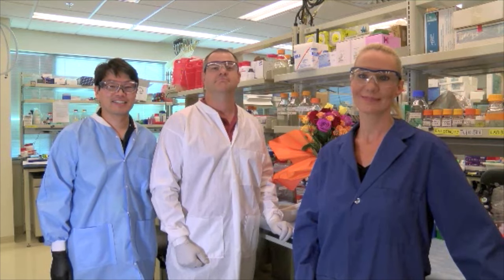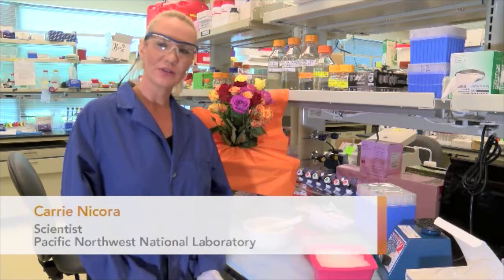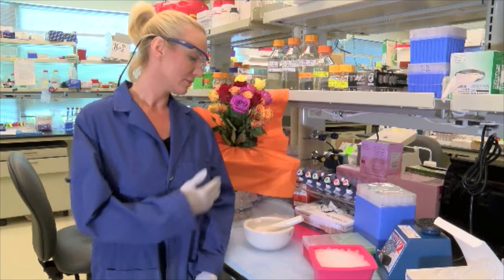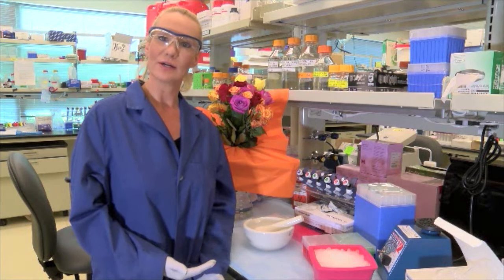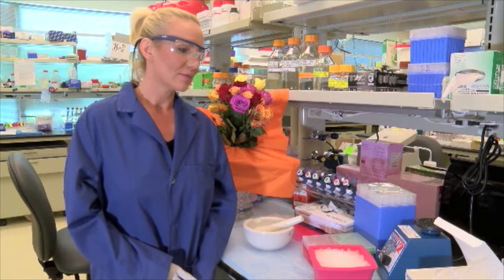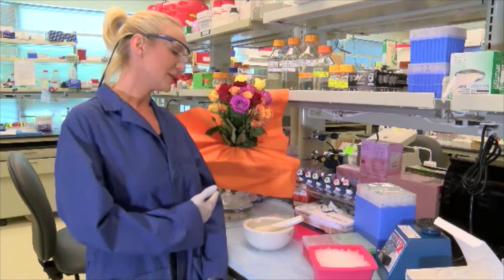Hope you enjoy it. So the MPLEx protocol can be used on any sample type, including bacteria, viruses, but it can also be used on plant tissue. It can be used for any kind of human tissue, including brain, liver, heart. What we're going to be demonstrating today is the plant tissue.